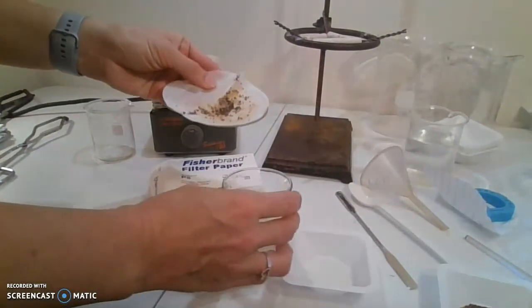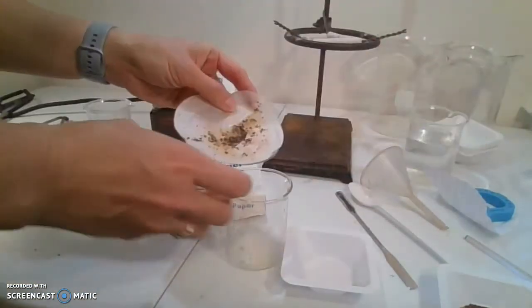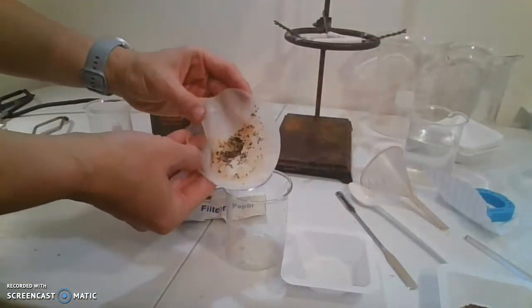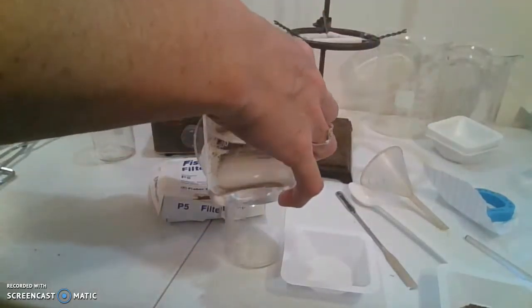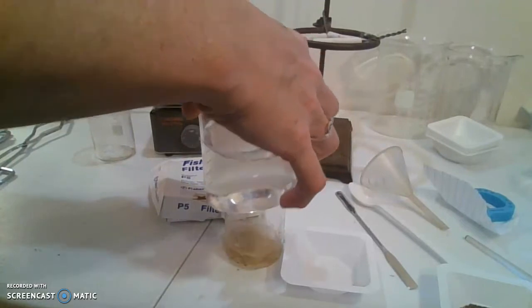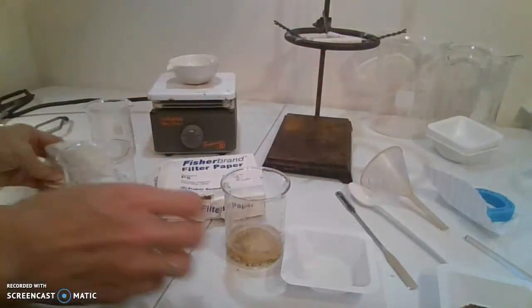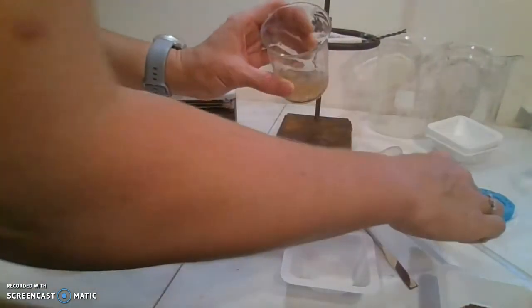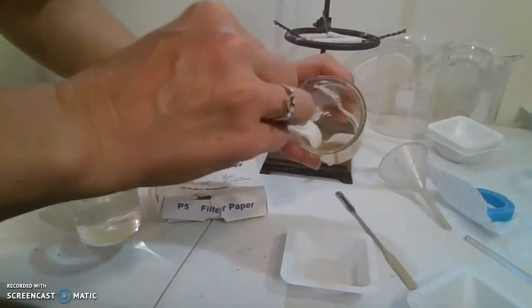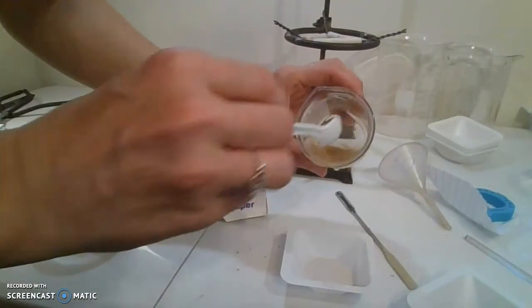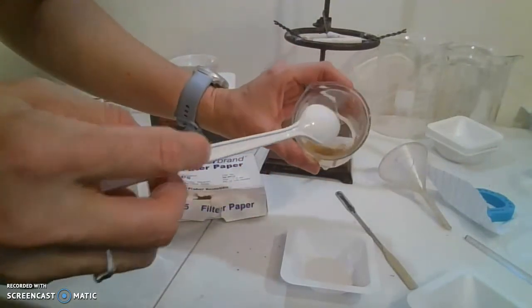you can take a beaker and literally put it back into water. Then we can remove the poppy seeds because they're the ones that are floating. But they do tend to get a little waterlogged, so that is a source of error.